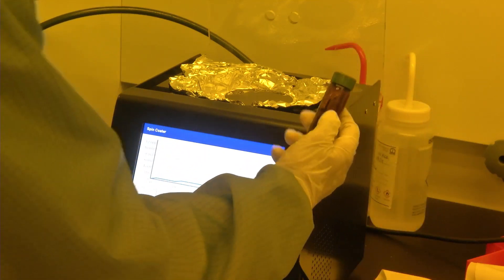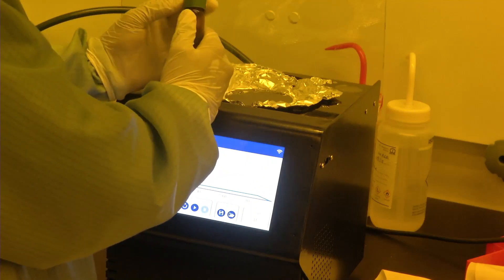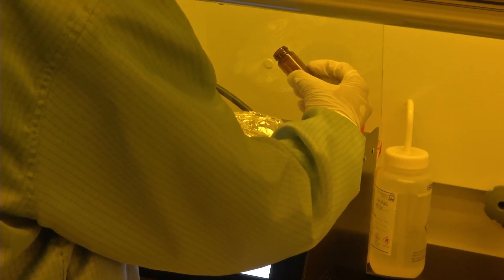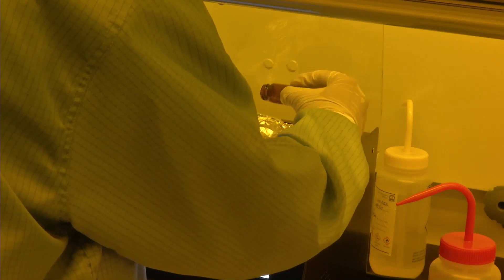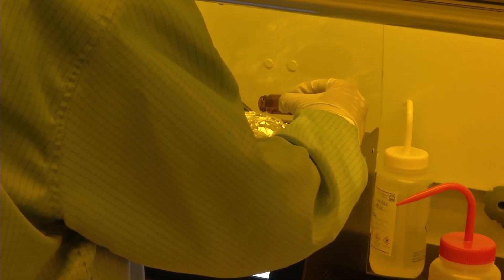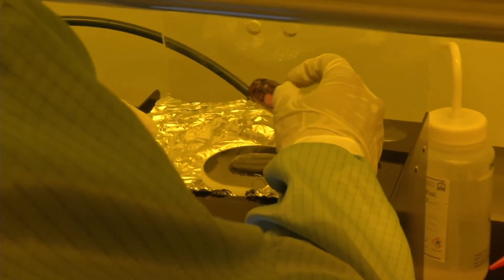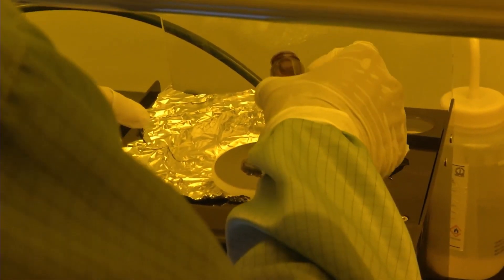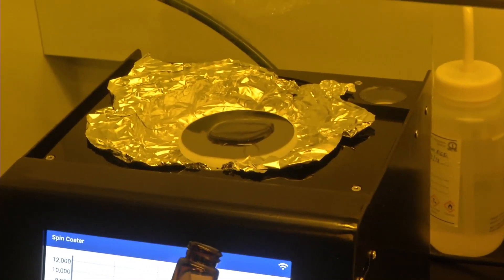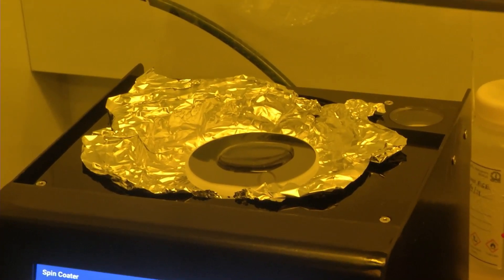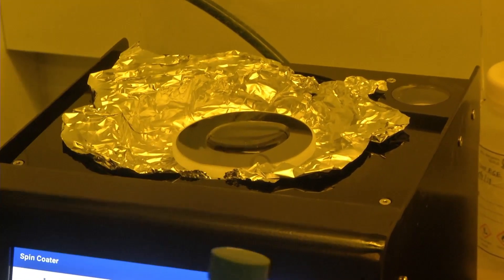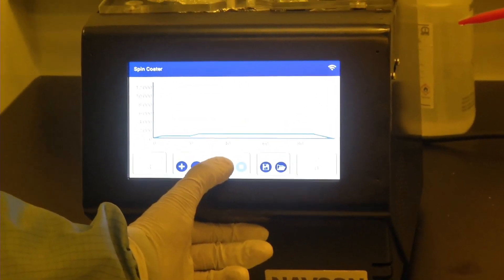My colleague will use a dedicated vial for pouring the precursor onto the silicon wafer. Pouring itself requires some practice. We need to ensure that there is no bubble formation, so we need to be very careful while pouring the polymer precursor. We need to pour it very gradually to ensure that there are no air bubbles formed on the silicon wafer. He will wipe off the excess polymer from the vial to keep it clean, and now he will close the lid and press the play button to start the spin coating process.